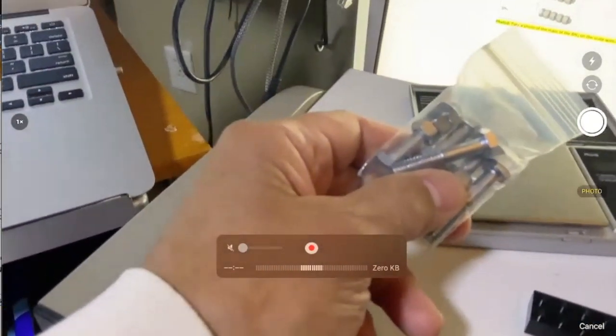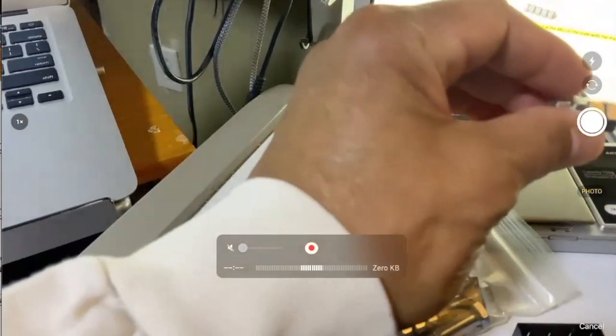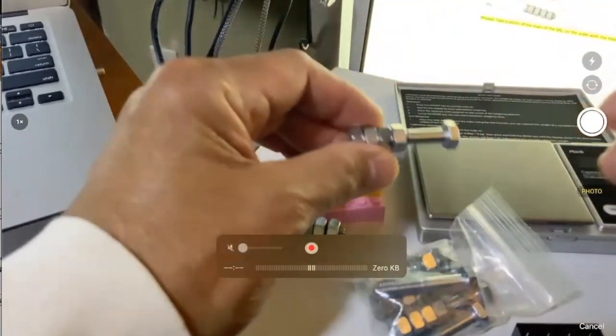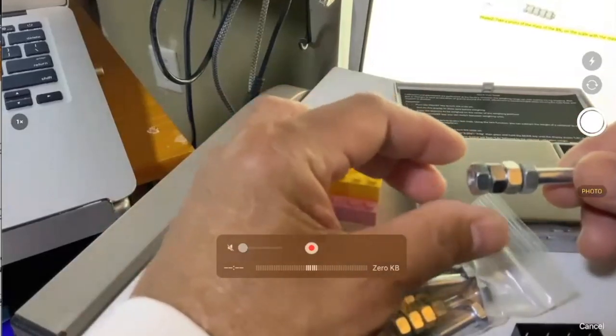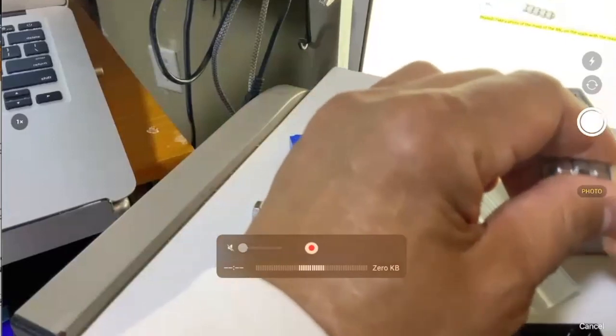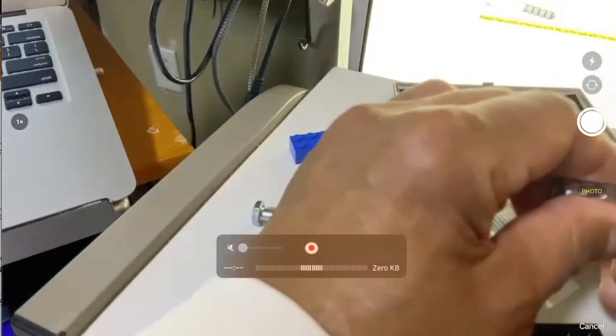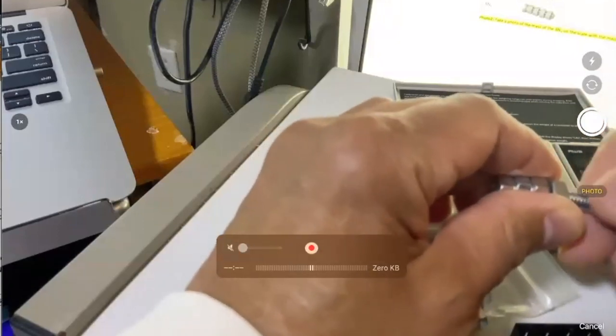And what you need to do is take your, this is called a BN, it's called a BN4. Why is it a BN4? Because it's got 1 bolt and 4 nuts. So unscrew all of these and get all your nuts together. Okay, hardware nuts here.